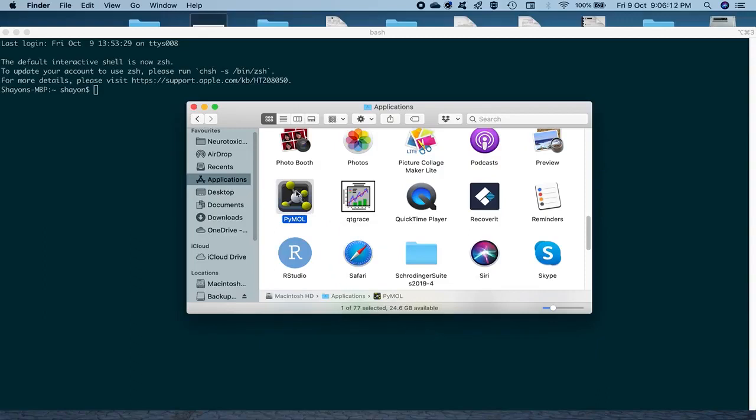So first of all, you click on the icon of PyMOL that you might have on your desktop as a shortcut in Windows. So we click it twice.